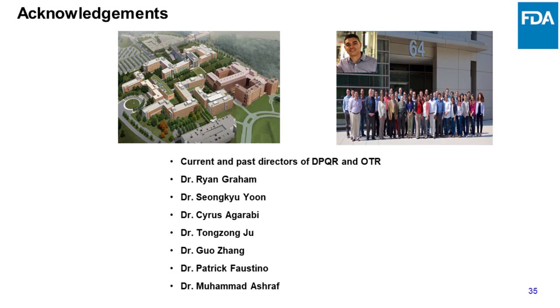A triple quadrupole system is not technically a triple quadrupole, because the commercial instruments on the marketplace use either a hexapole or an octapole as a collision and reaction cell. But having a quadrupole in the reaction collision cell allows you to have much better control over the secondary reactions. And there's no question there are benefits, because it allows you to pass the analyte ion through to the analyzer quadrupole without fear of interfering ions coming from secondary reactions.